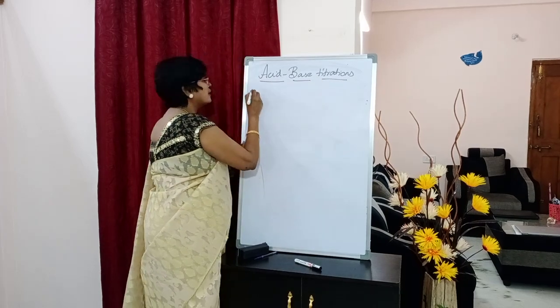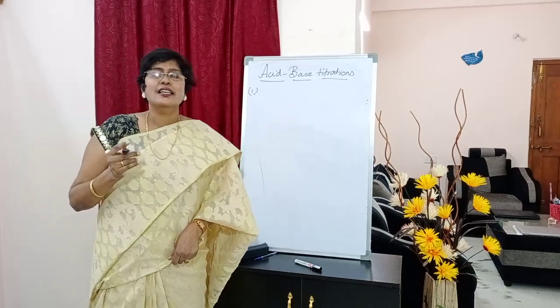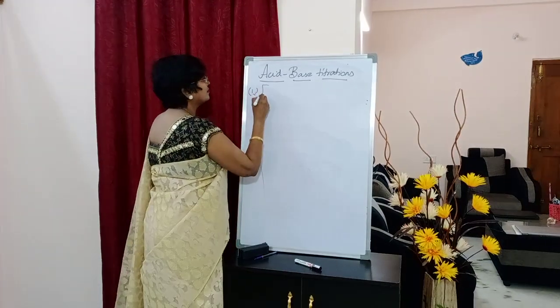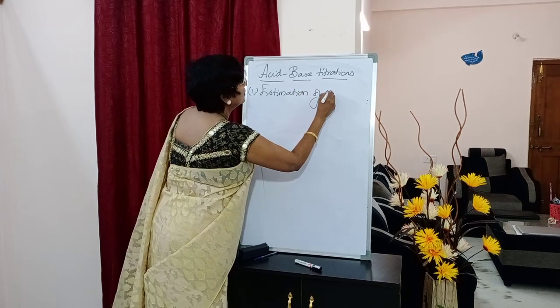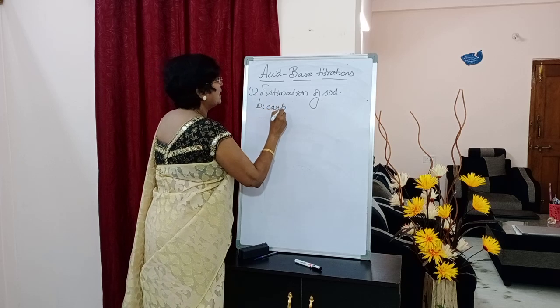The first experiment under acid-base titrations in your semester 3 syllabus is estimation of sodium bicarbonate.